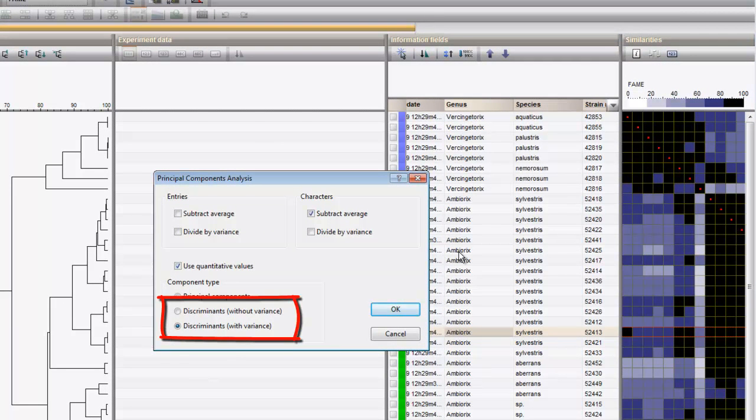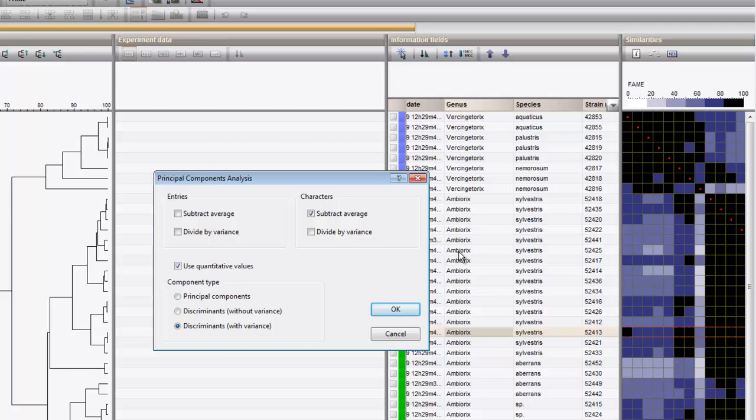Discriminants with or without variance. This relates to the fact whether the internal spread of the group is taken into account or not. If you want to account for the internal spread, use the option with variance.